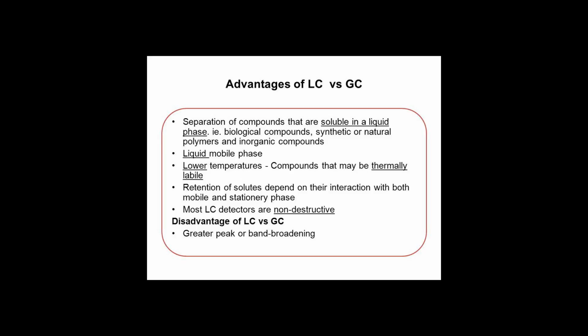Particle size. Most traditional HPLC is performed with the stationary phase attached to the outside of small, spherical silica particles, very small beads. These particles come in a variety of sizes, with 5 micrometer beads being the most common. Smaller particles generally provide more surface area and better separations, but the pressure required for optimum linear velocity increases by the inverse of the particle diameter squared. This means that changing to particles that are half as big, keeping the size of the column the same, will double the performance, but increase the required pressure by a factor of 4.